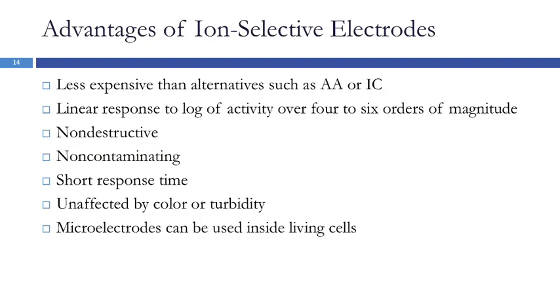So much less expensive. The linear response to the log of the activity: these electrodes don't actually measure concentration. They measure activity of the ion. I'll mention exactly what that is in a minute. But they respond to the log of activity over 4 to 6 orders of magnitude. So there's a wide range over which they can be used effectively.